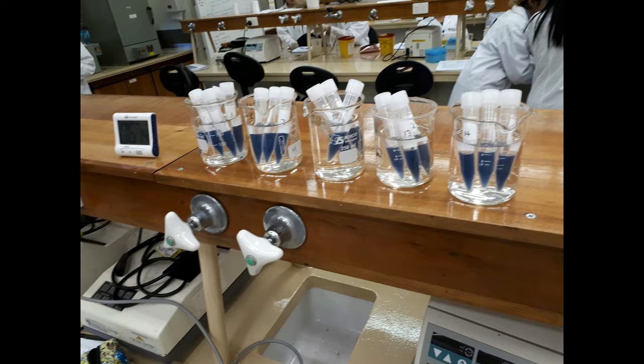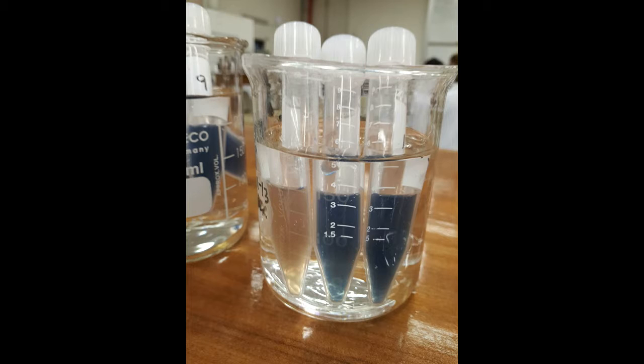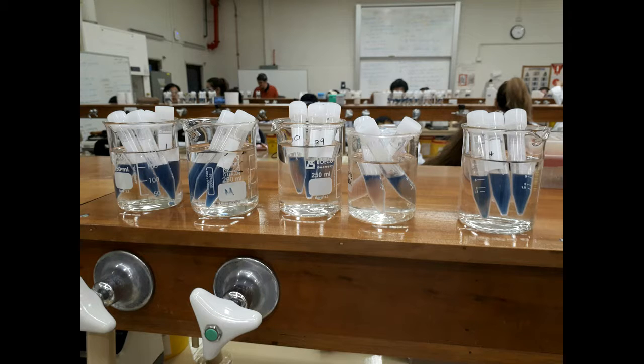Our results were a little unexpected. The DCIP in our experiment took longer than expected to change colour compared to the expected results. However, the order at which the various substrates went colourless was as predicted. First to lose its colour was the succinate solution, followed by lactate and then malate. Pyruvate did not cause the DCIP to lose its colour.